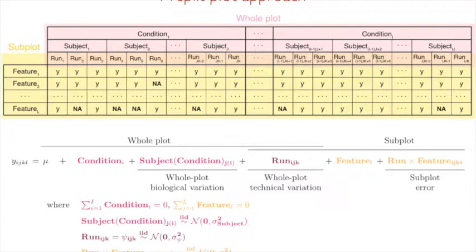And then we will use a linear model to look for differences between protein abundances on the summarized protein levels. And so this is very useful because on one hand, we actually have some numbers. We can say this is the estimate of protein abundance in a person, summarized across all the features after normalization and so on. So for example, if you want to do clustering or classification or draw heat maps or things like that, you can use that.